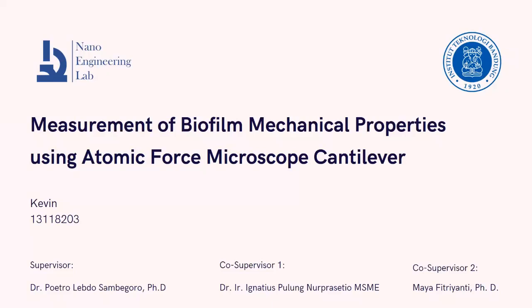In this opportunity, I would like to show you my research on developing an atomic force microscope setup to measure the mechanical properties of biofilm. First off, you might be wondering why do we need to measure the mechanical properties of biofilm in the first place? Before we get into the research experiment and data, I would like to introduce you to the core of the problem.